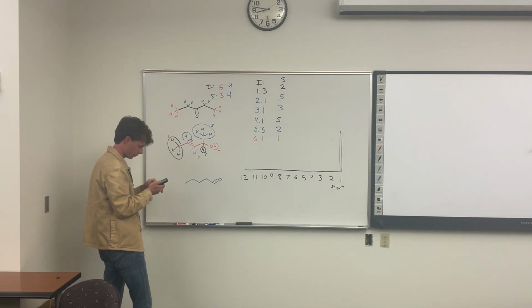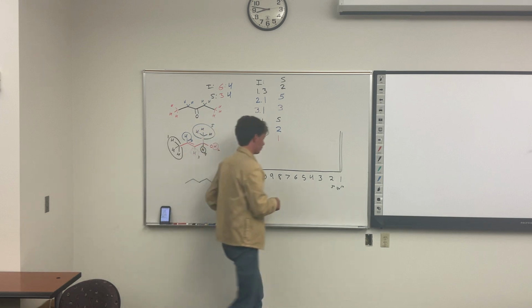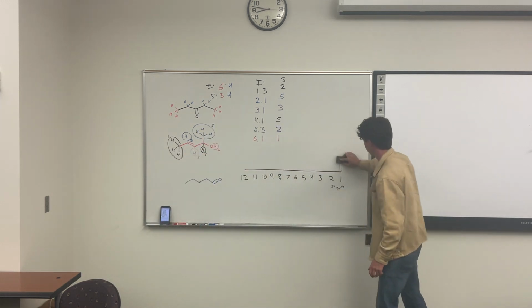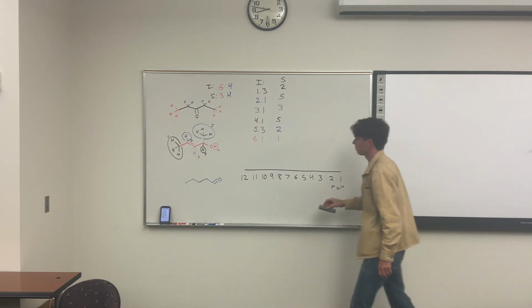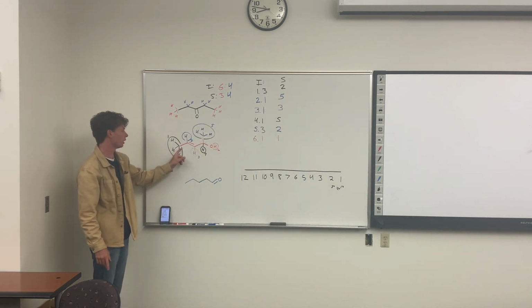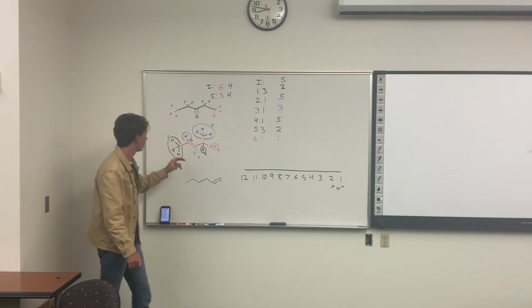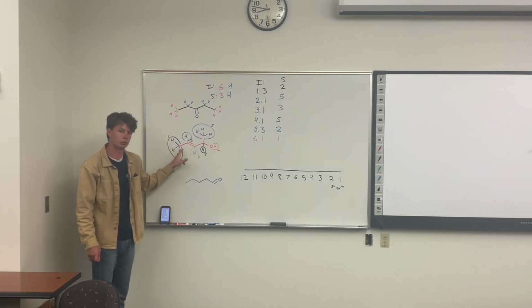Do they have, they do, okay. I'm going to take this signal and move it over a little bit, because that's not necessarily the primary position. I screwed up. What position is this more correctly? This is the allylic position.